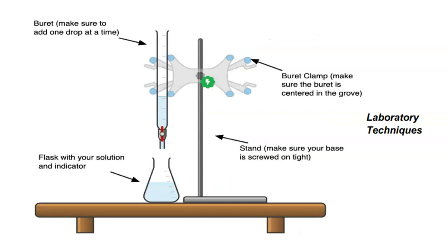This is going to be your setup for the most part. In a titration, the titrant is added from a burette, and I wanted to point that out from before. It is your titrant that is inside your burette. Now, maybe in some other experiment, not this one, you have water in there, then water is your titrant, okay? So the titrant is added from your burette into a flask with a measured amount of another substance in a solution, okay?